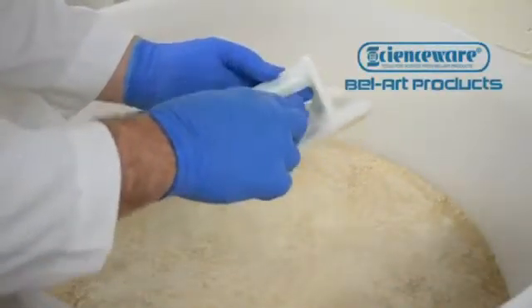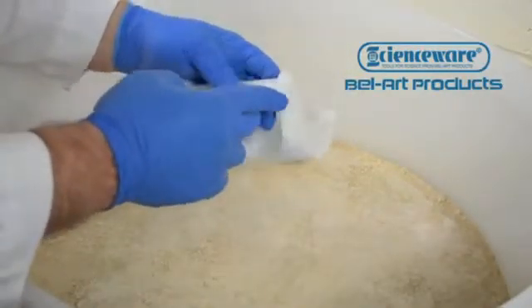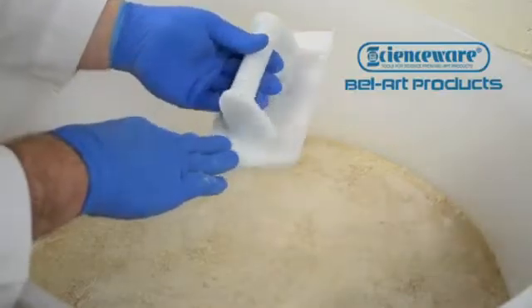The solid core handle and welded parts prevent the collection of dirt and debris on the trowel. It is also compatible with industrial dishwasher water temperatures and cleaners.